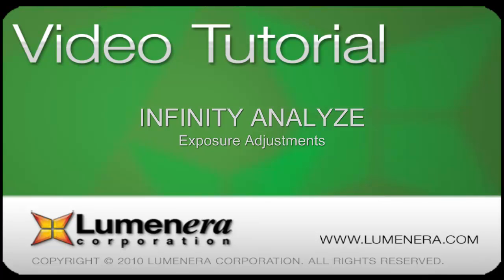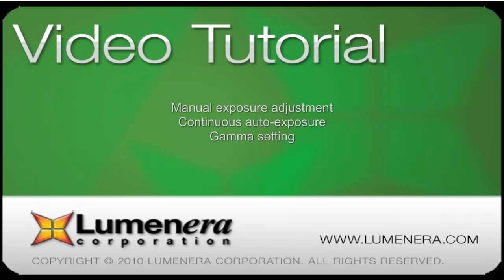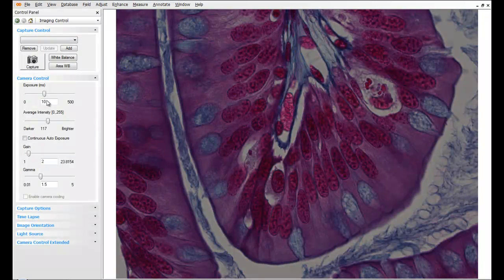This is part of the series of tutorials that provide an overview of the Infinity Analyze capabilities and features. In this tutorial, we'll take a detailed look at the exposure adjustments. Setting the correct image exposure is an important step to obtaining optimal image quality. Within the Infinity Analyze application, we have several adjustments on the camera control pane to control the exposure.